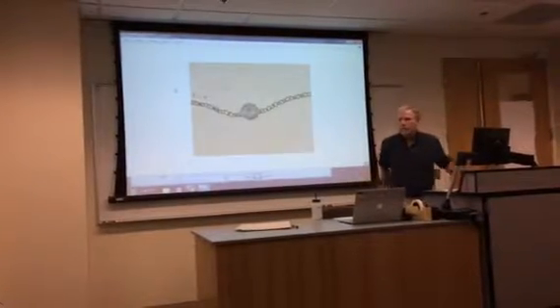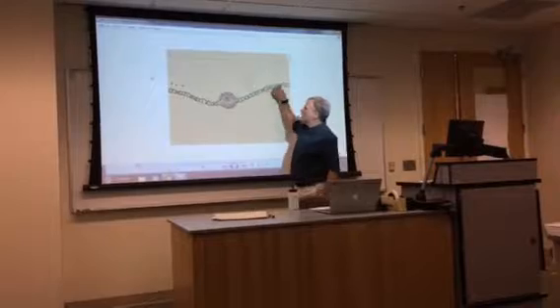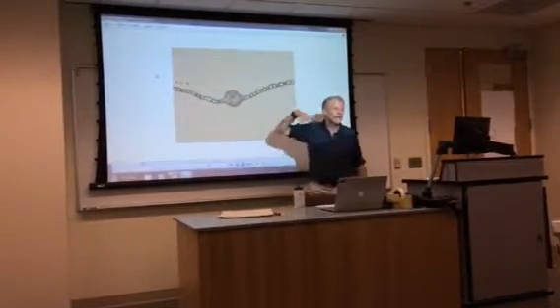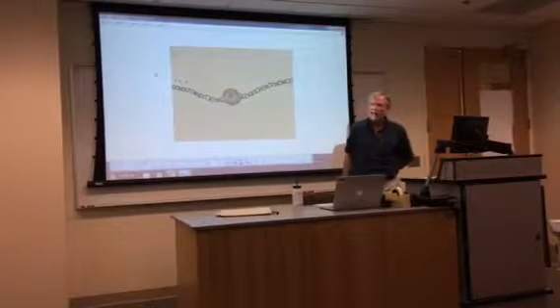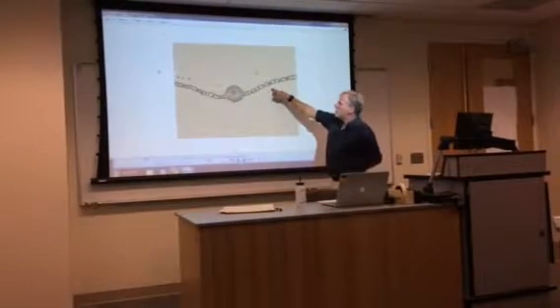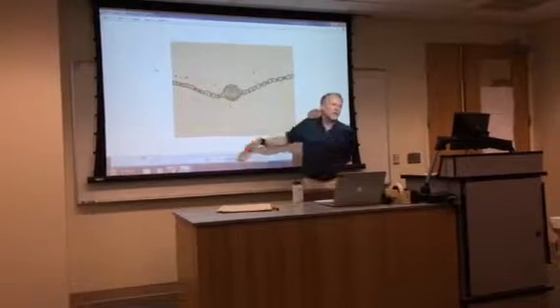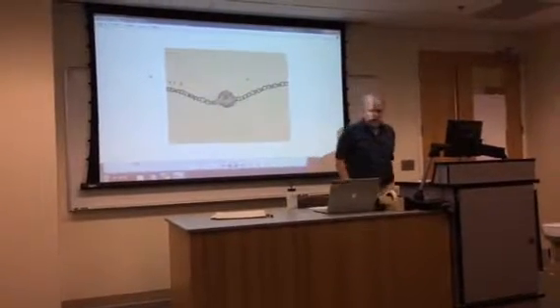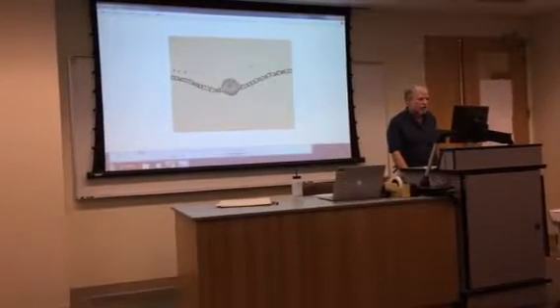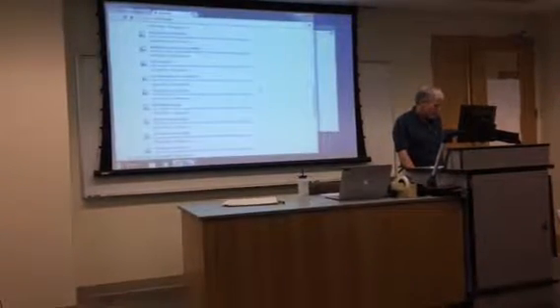the sphagnum. Okay, so here's a leaf, single cell layer thick. So leaves, again, this is leaves of gametophytes, so analogous, not homologous to leaves of sporophytes. Difference is single cell layer thick, and there is a midrib. So in mosses, there is a midrib. The leaves are spirally arranged, and we'll learn how to distinguish those from leafy liverworts.